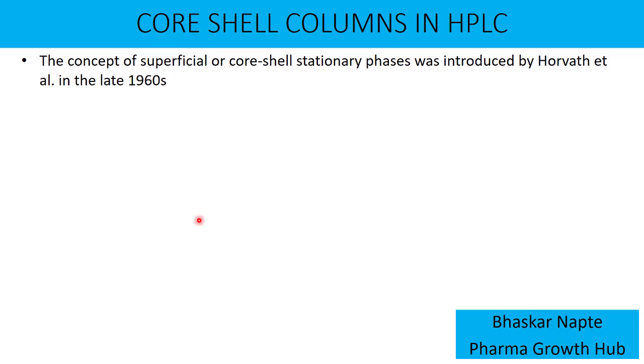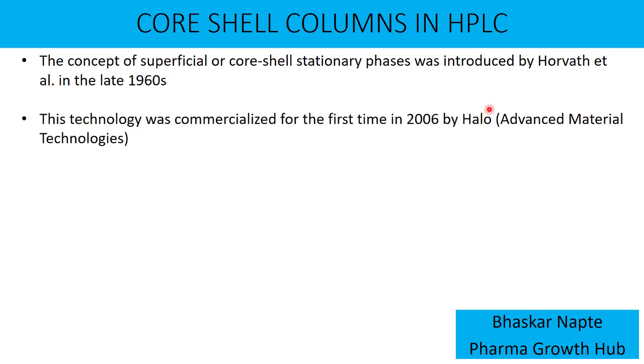The concept of superficial or core shell stationary phase was introduced by Horvath et al. in the late 1960s. So the invention is from the late 1960s. However, the commercialization of this technology took a long time, and in 2006, Halo introduced this technique into the market.